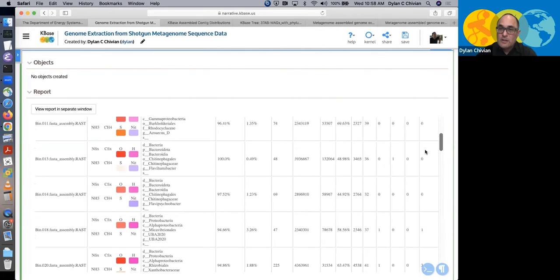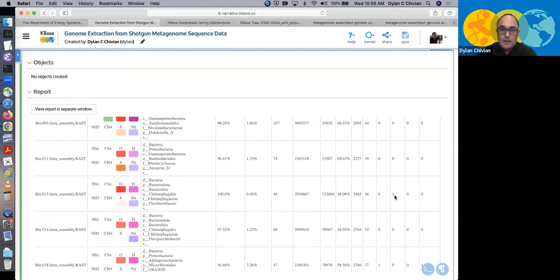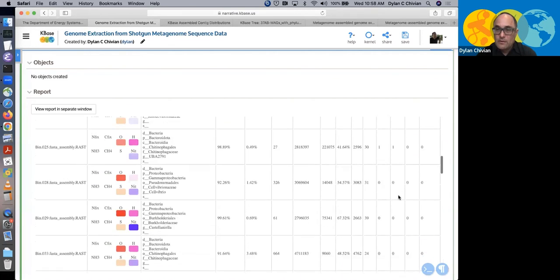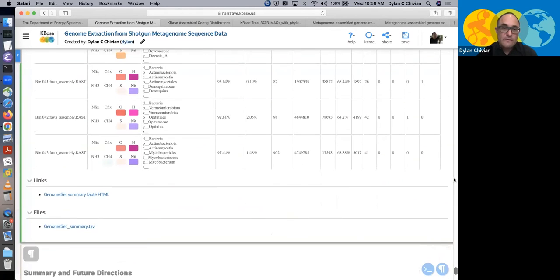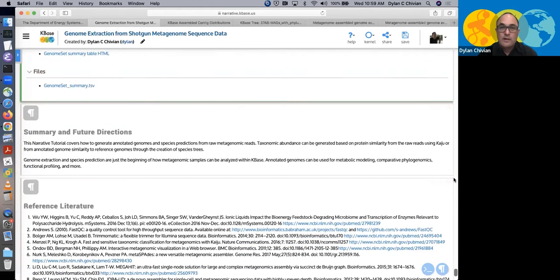So this summary does show up, and in fact, sometimes you do get a 16S here, though it's still not going to meet the MIMAG threshold for isolate level quality, but bin 37 appears too, and so on. So you can use the summarized GenomeSet to have a look at everything that's coming out of your MAG recovery.